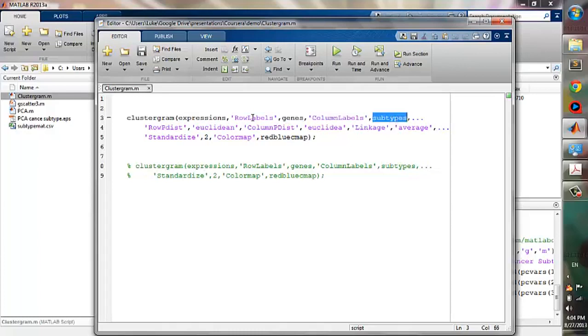And then the column labels, which are the subtypes. Then are the row pdist and column pdist, which specify the metrics to be used in row-wise hierarchical clustering and column-wise hierarchical clustering. We will use Euclidean for both. The linkage function, we will use average.